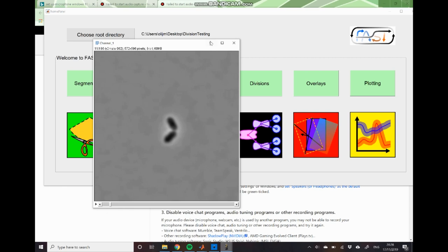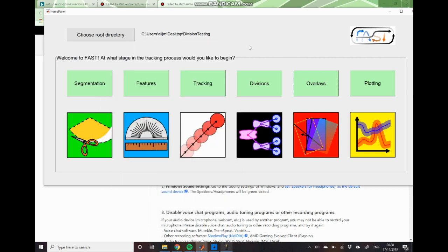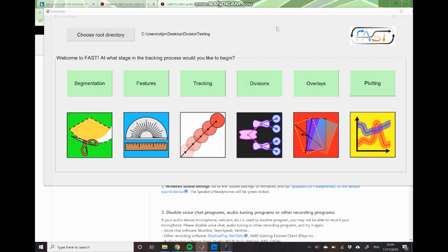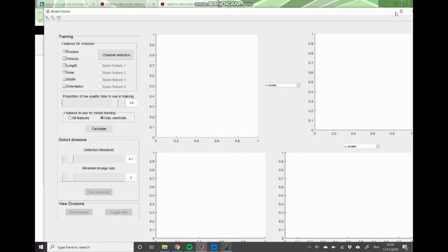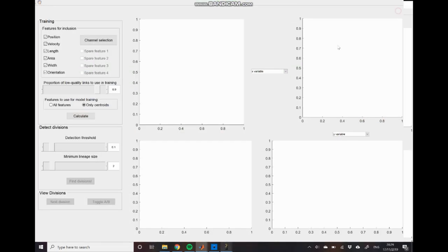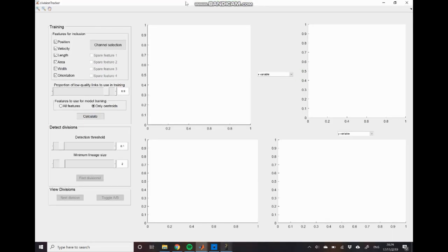So to do that we just open up the division detection GUI and when we do that you can see that this looks very similar to the tracking module, which is no coincidence because the modules are based on very similar algorithms.